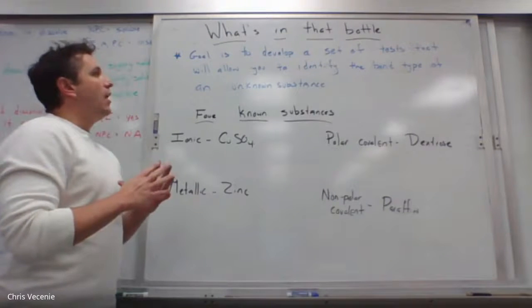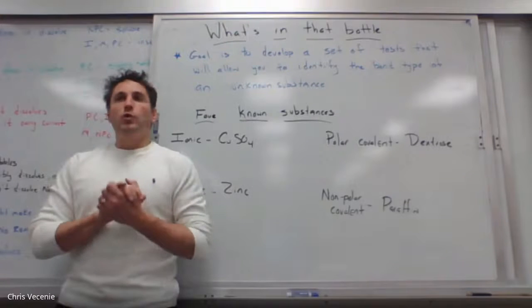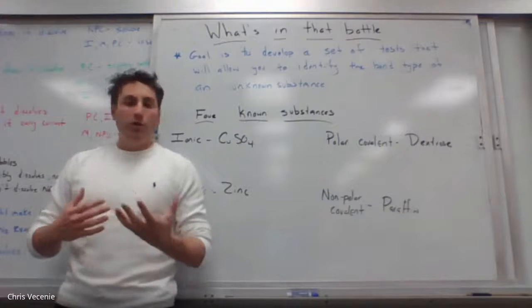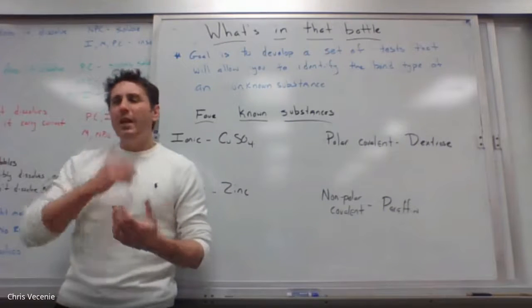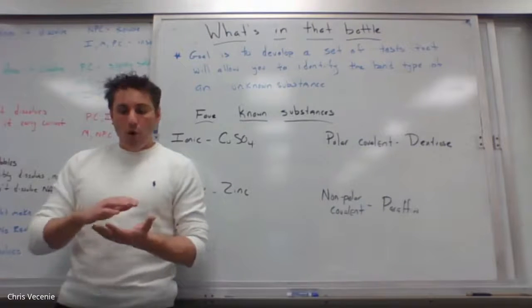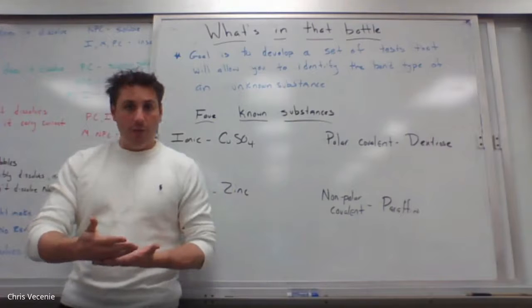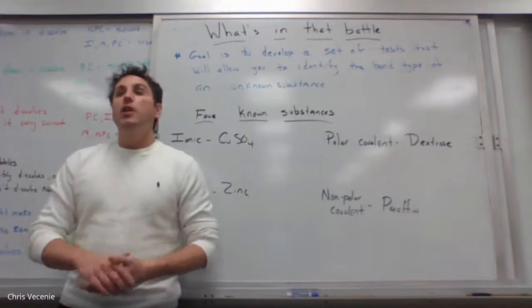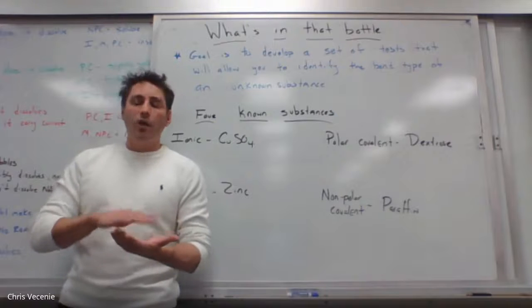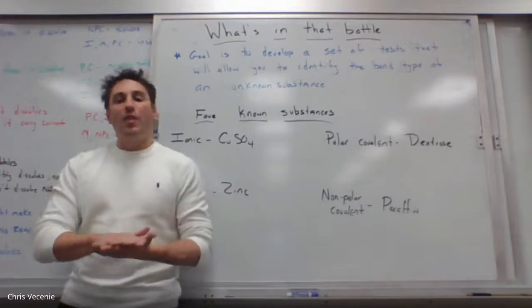And if we're going to do that successfully, we have to be able to run a battery of tests on our solids, sort of like if you go to the doctor. Some of those tests don't confirm what something is, but eliminate another option and help narrow the field. Some of those tests are more confirmational, where we think we have it narrowed down, and now we're going to try to confirm it with that test.